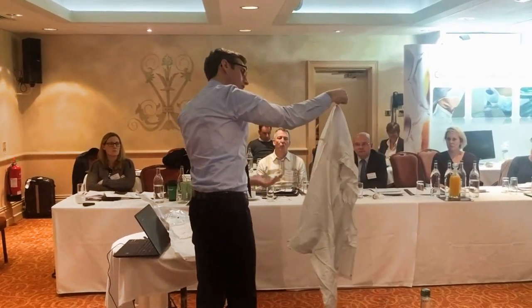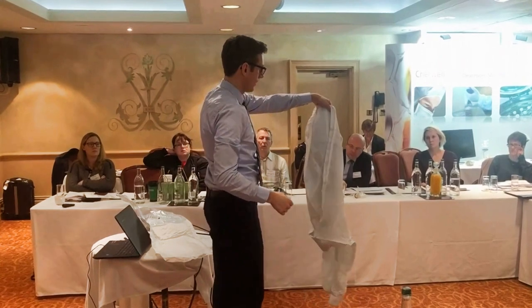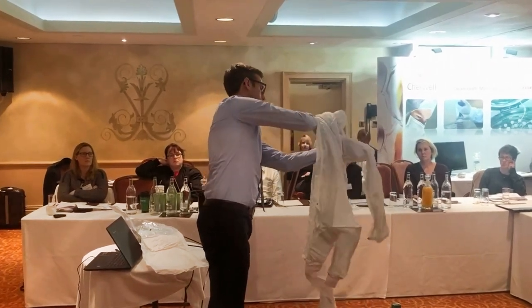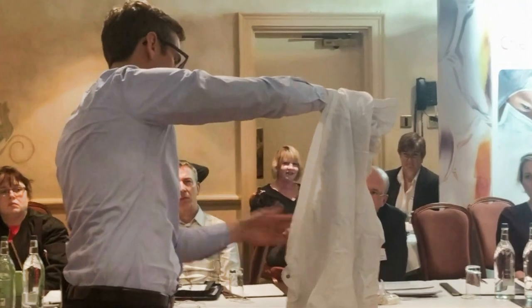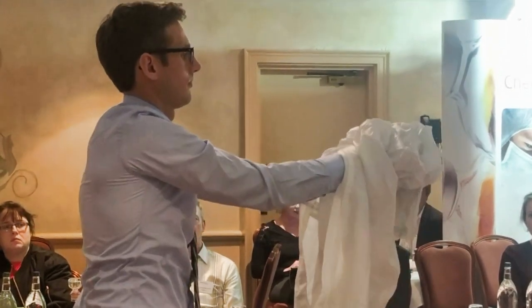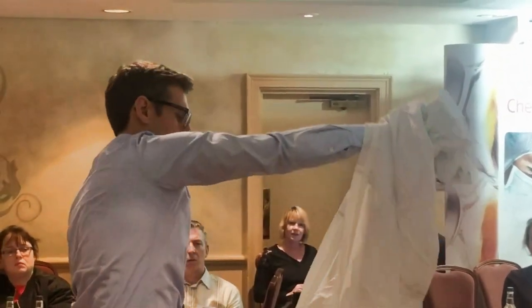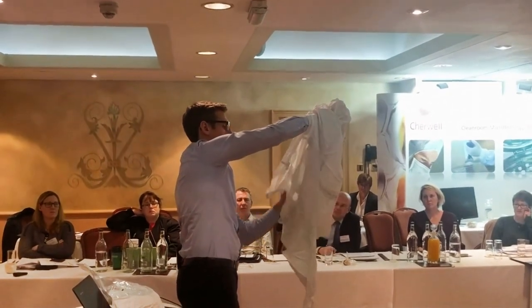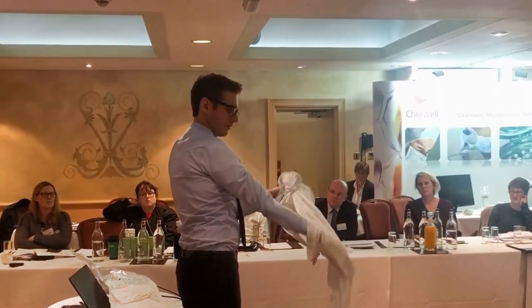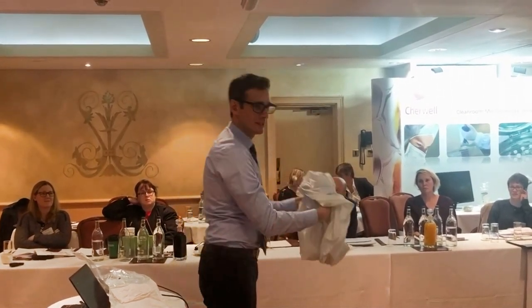And this is again one technique, which is not the perfect technique. I take the overall on the inside here, grab my right leg. So I get inside the overall, collect the material, take care that the outside doesn't turn inside, grab the left leg, we also call it overall origami, grab the left arm and collect all the material here, take it in my left hand and grab the right sleeve. And then I'm completely confused.